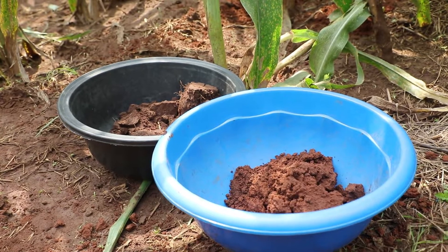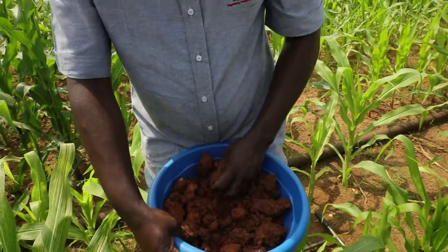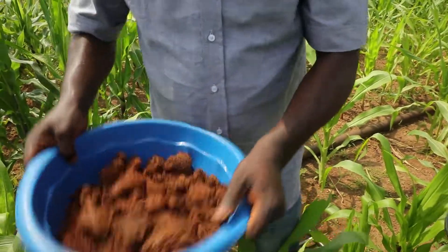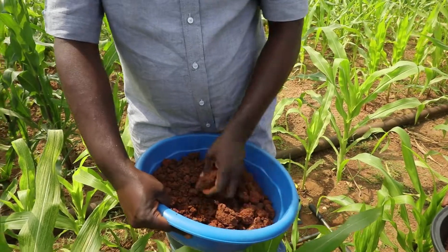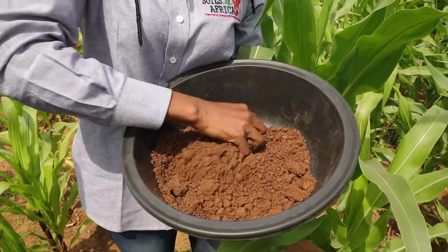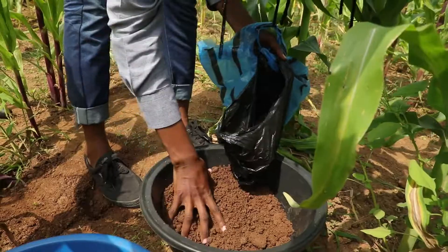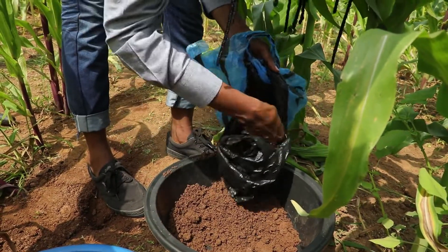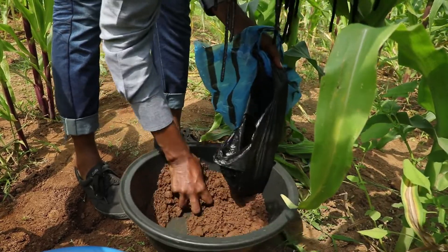After you have deposited topsoil and subsoil samples in the topsoil and subsoil buckets, mix them thoroughly. After the samples are mixed, take 500 grams of each and put them in separate plastic bags.